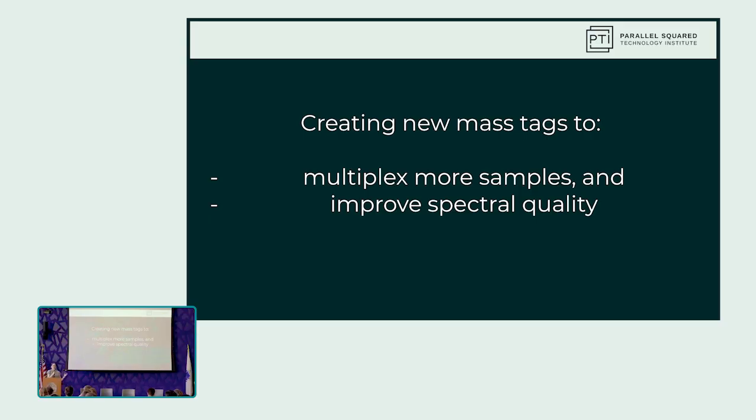So to reiterate, but also to orient us towards the research portion of this talk, today Mark and I will be talking about creating new mass tags to first multiplex more samples, and secondly, to improve spectral quality.